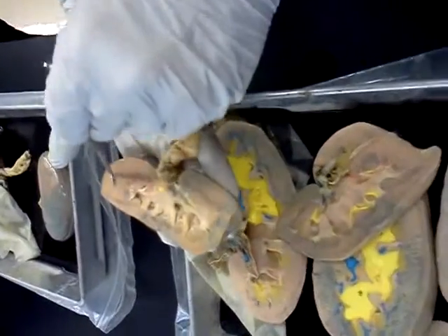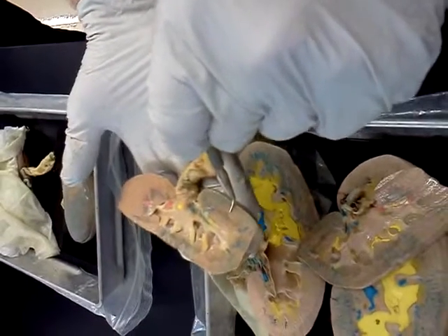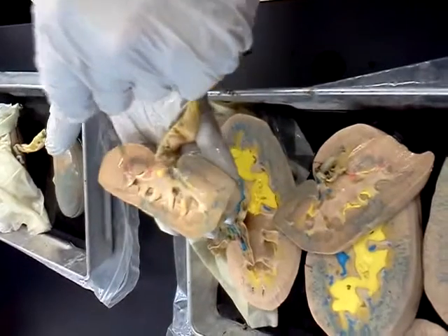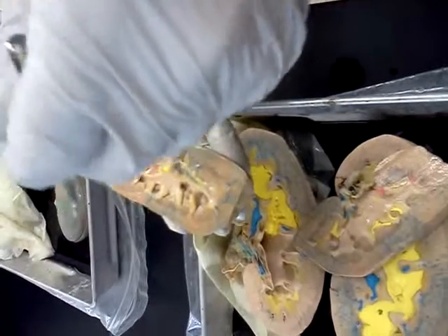Some other aspects. Again, you see on the outside edge here, this is all cortex, and that's where some of the color is, because there's lots of vasculature in the cortex. The vast majority of the renal corpuscles are in the cortex. They're cortical, which means they're out near the outer edges. The juxtamedullary ones are down near the cortex-medulla transition.